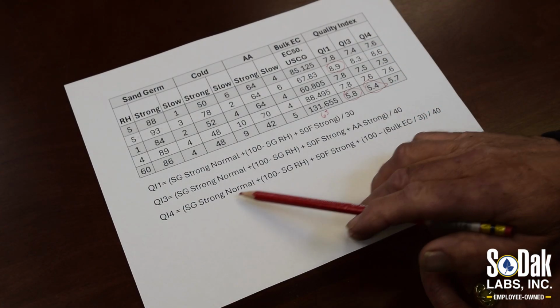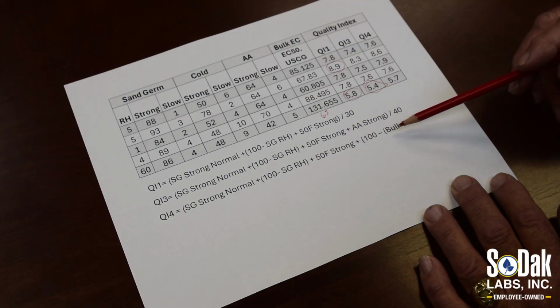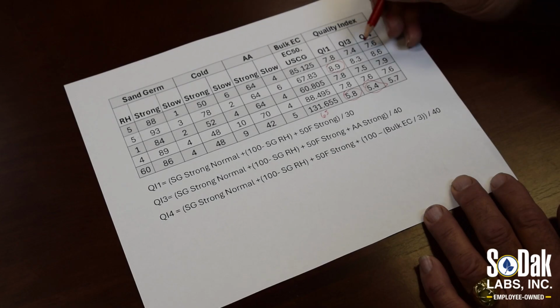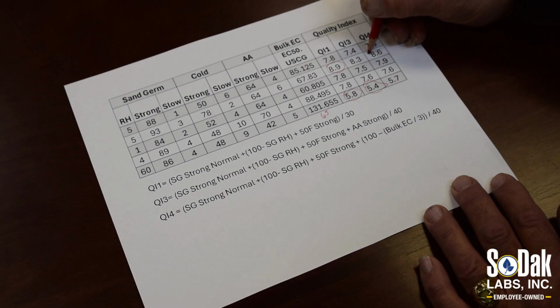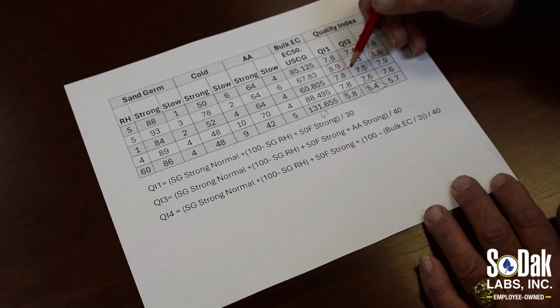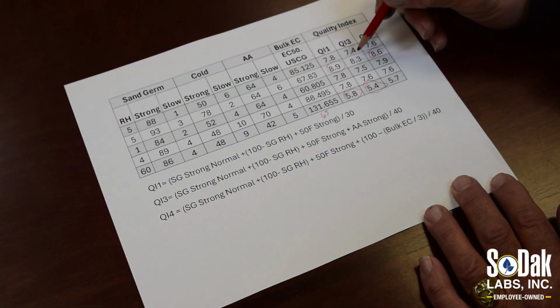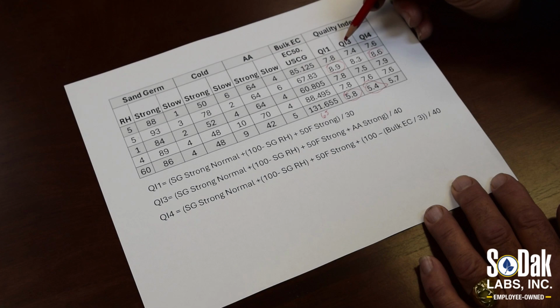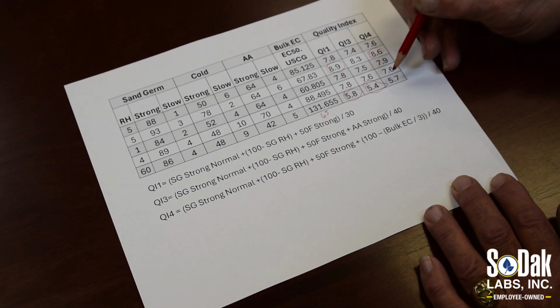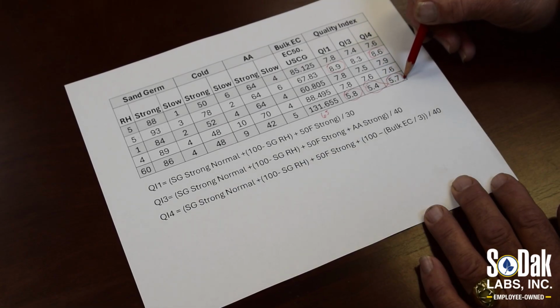So we retain the 3 originals of Q1, then we add bulk EC in here, and what we see here is that we're still ranking number 1 here. We moved back up, compared to the quality index 3, closer to QI1, but the best is still the best, and the worst is still the worst index.